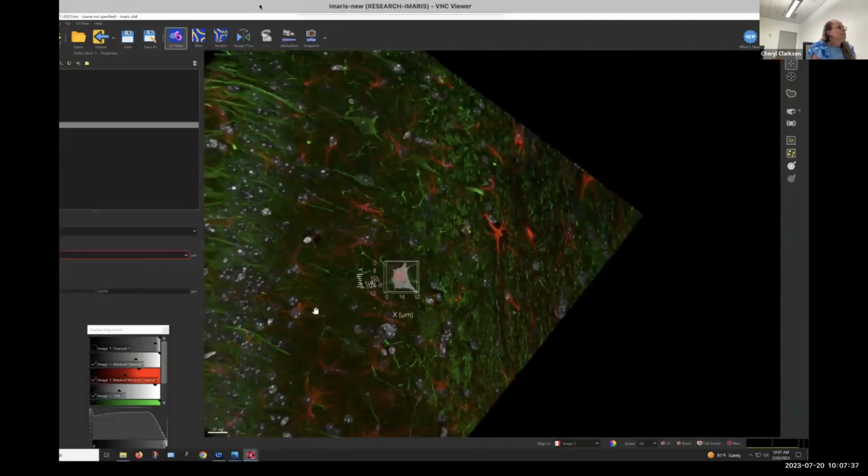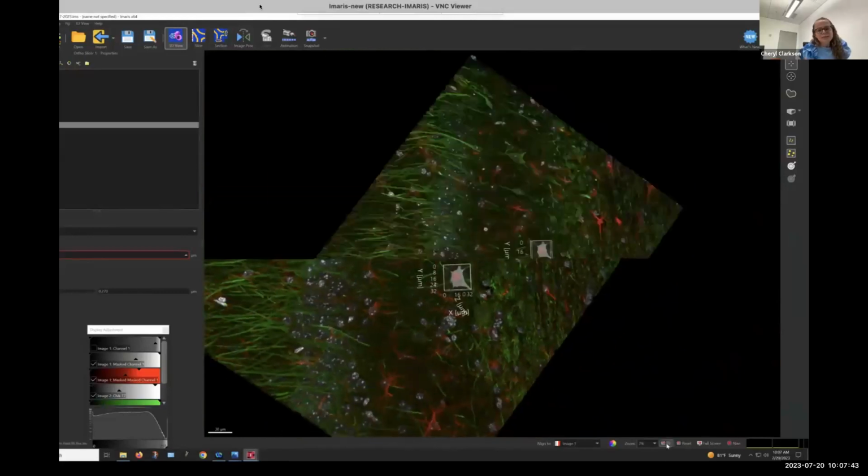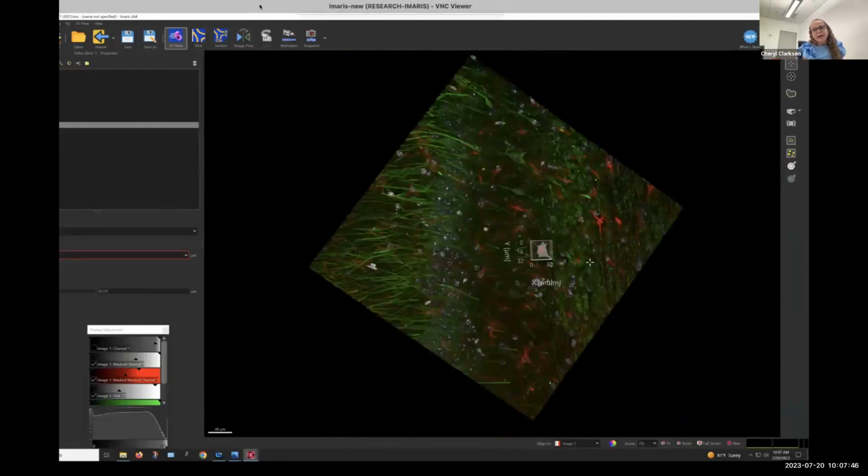This is a practical example of what I want to show. For me, this is the most exciting part because it's what I was thinking we were not able to perform, that is CLEM with volume scope. Volume scope is the easiest way right now to run a large area in 3D SEM, but it's always very challenging because you are entering blind. So I was thinking I would have to cut a lot until I'm able, and I'm going to pass the volume that I already registered for the light microscopy, but we were able to do it, and in the end, it was very easy, in some way.